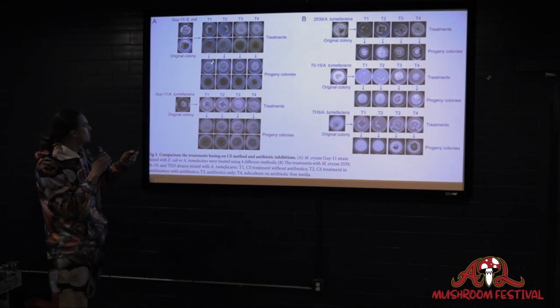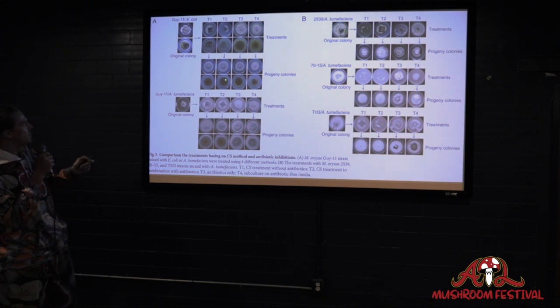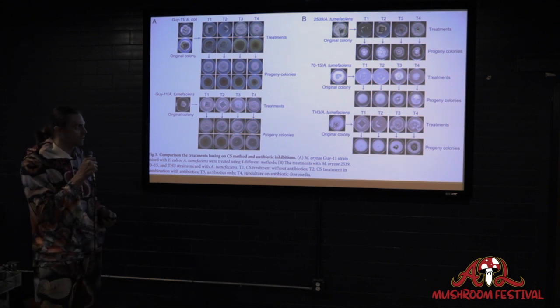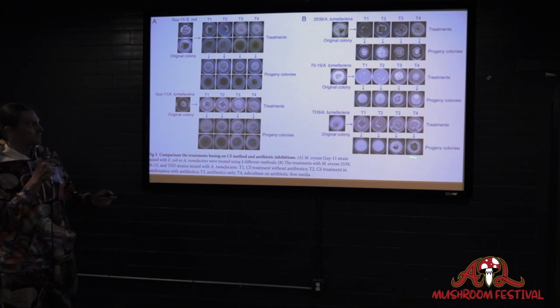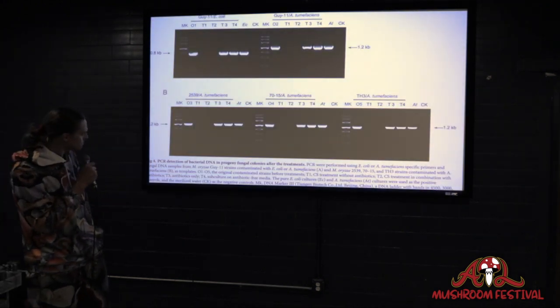And the same thing with your other cultures. Same exact thing. T1 and T2 looked pretty much the same. T3 definitely looked worse than T1 and T2, and T4 was definitely the worst of all, and still often looked as though it was still contaminated.